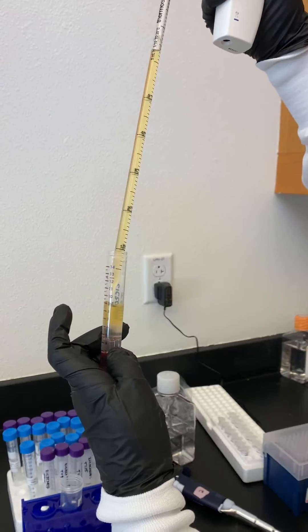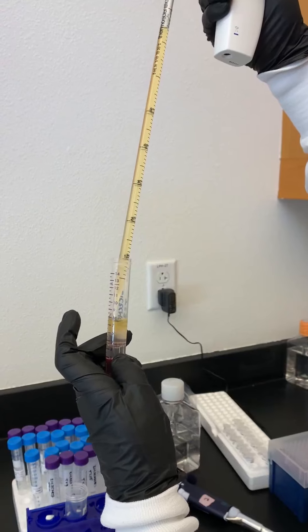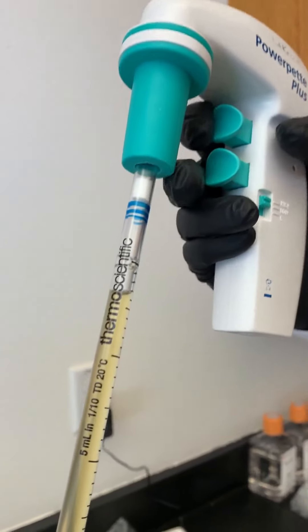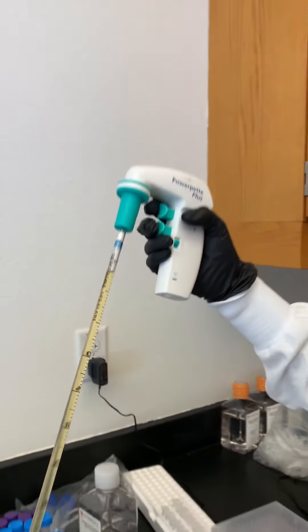We also never want to overfill a serological pipette because you can ruin the pipettor itself. If you look at the top of this pipette, there's a little filter. If liquid goes past the filter, it will actually get into the pipettor and ruin it.